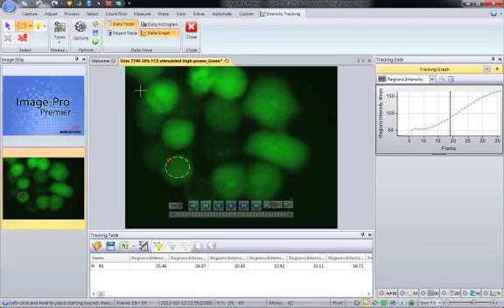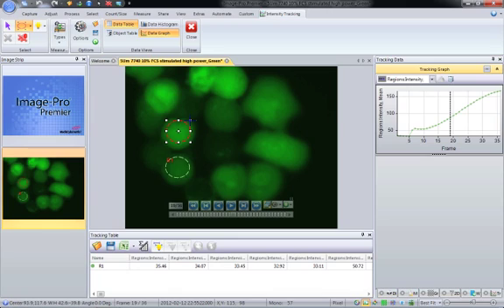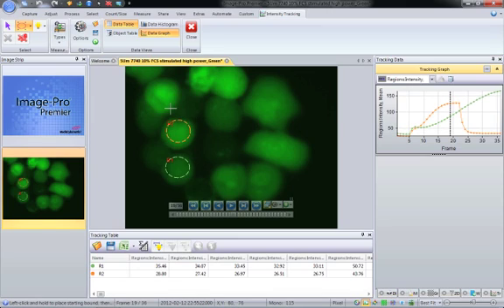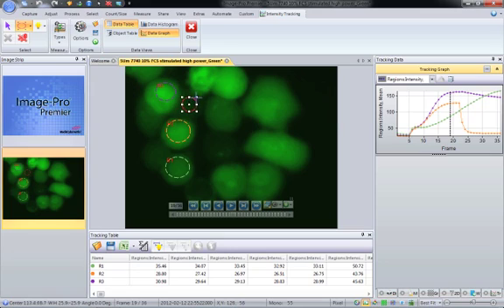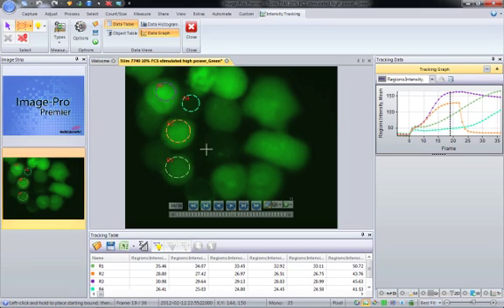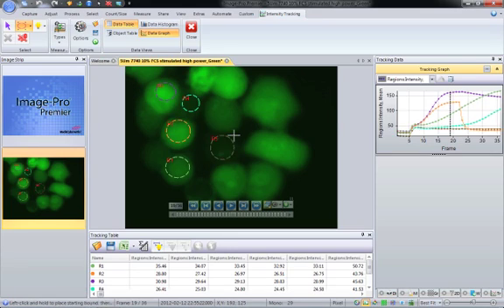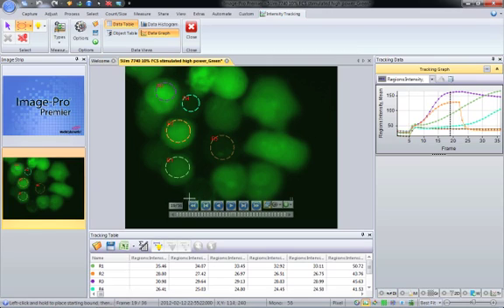If I want to add another region, just simply click and drag, and there is my other region. I can carry on adding regions, as many as I need. And you see every time I add a region, it automatically gets added to the data graph.